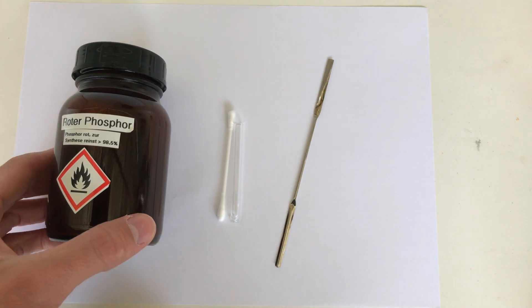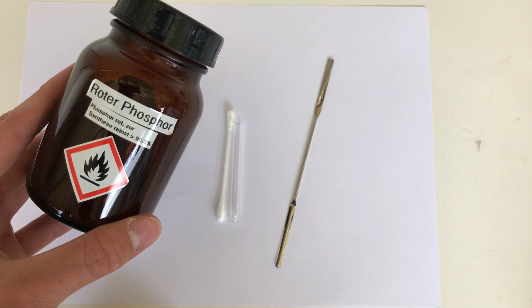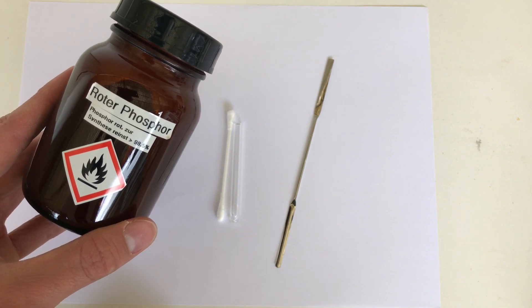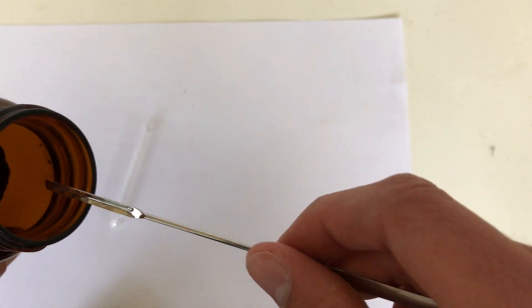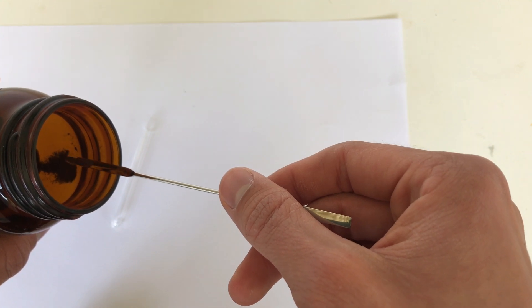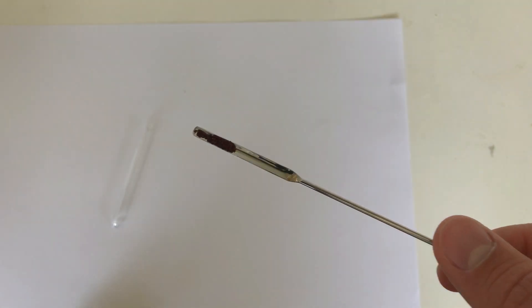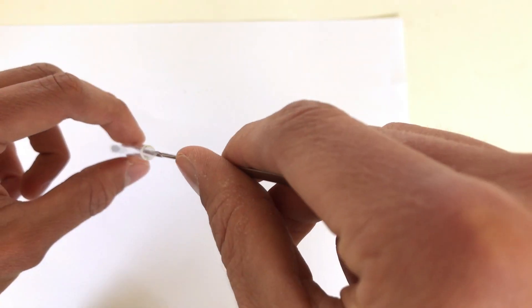White phosphorus, unlike red phosphorus, is highly toxic, therefore you shouldn't try this experiment at home. We start off by taking out some of our red phosphorus — it doesn't have to be too much — and we put it into our tube.